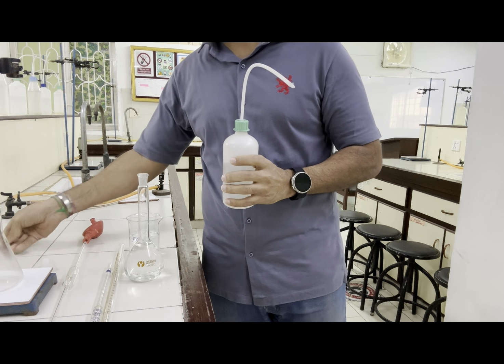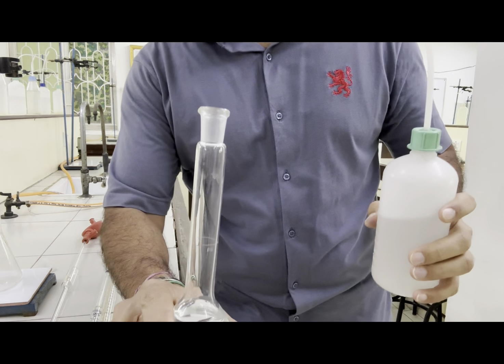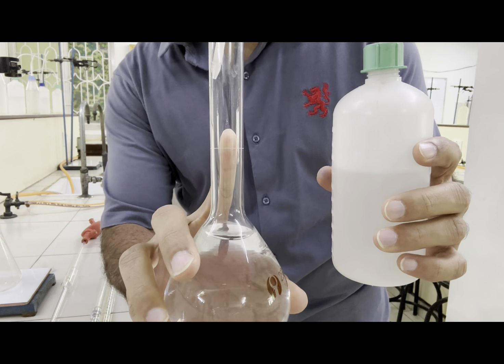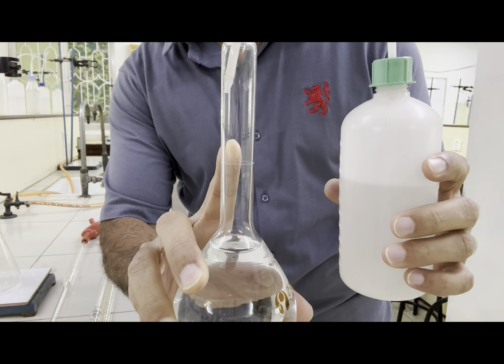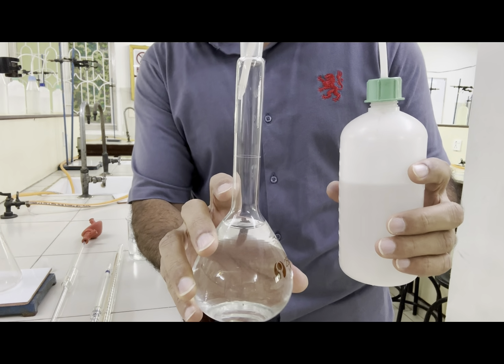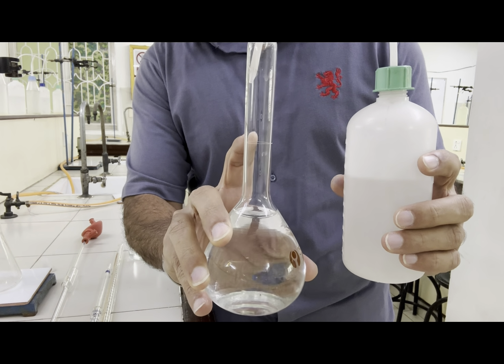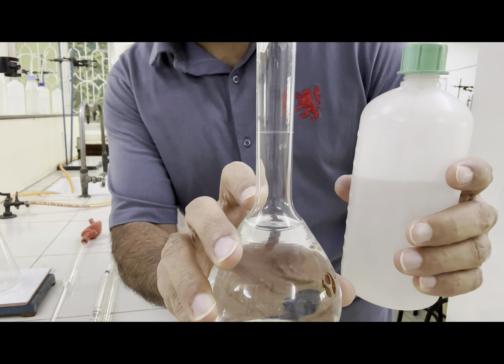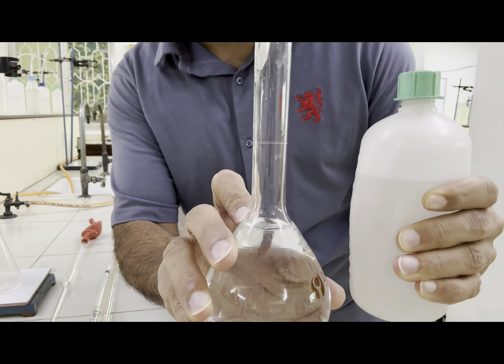Remove this funnel, and care needs to be taken while filling this using this bottle. Why? Because you cannot go more than this mark. Why? Because the dilution will be disturbed and you cannot discard once it goes up. So care needs to be taken that you fill up till this mark and that's it. You cannot go above this mark. So let me squeeze the bottle and start filling gradually.